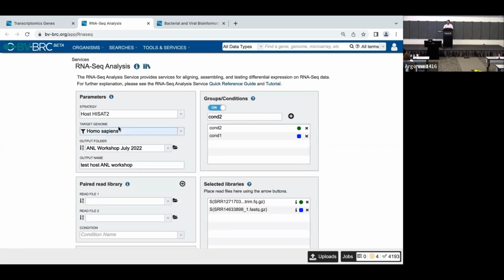Marcus, do we have any more Zoom questions or is that all? What you can do if you have a mixed RNA-seq sample is use the FASTQ utils to align those reads to a host or bacterial organism and save the unmapped reads. Once you have the unmapped and the mapped reads, you can take those reads and run the pipeline twice with a different reference genome. I mean, you don't even need to do that, right? The moment you pick the reference, it's going to align whatever it's going to align. Well, that's just to remove the excess unneeded information. It'll make your run faster if you separate the reads out first.